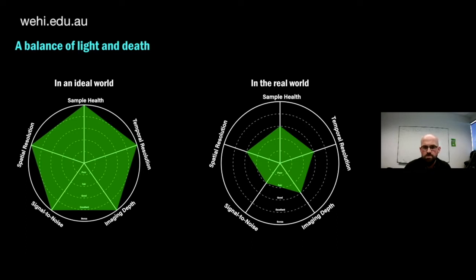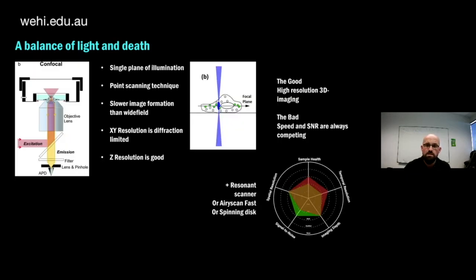So the way that we've been doing live cell biology for the last many decades has largely been using widefield and, importantly, confocal microscopy. Confocal microscopy is this wonderful technique where you're able to gain optical sectioning capabilities by only detecting the light interacting with the cell at your focal plane. So you shine a laser, it focuses it to this very small point, you scan that point across your cell, and you detect the light from that specific focal plane.